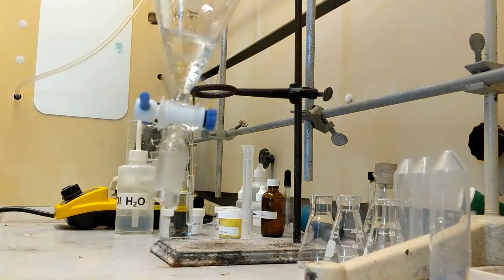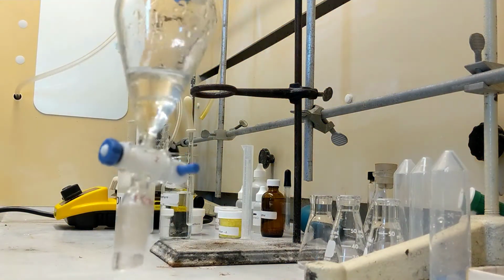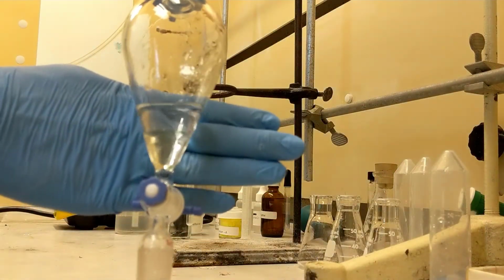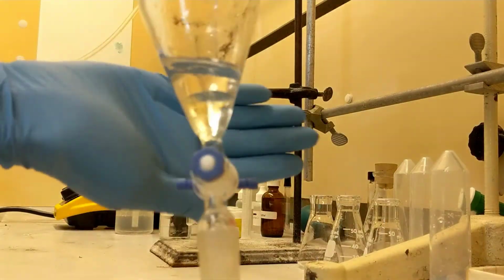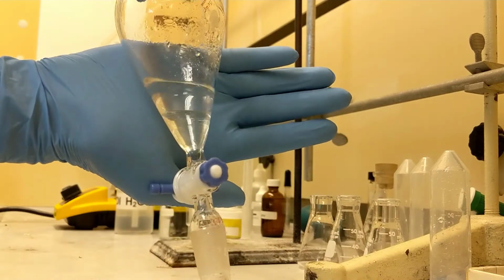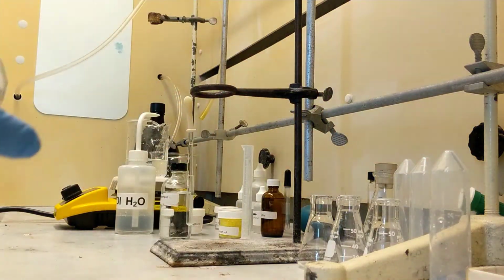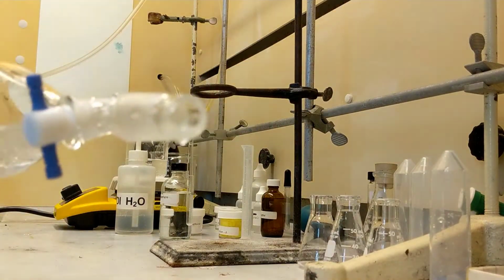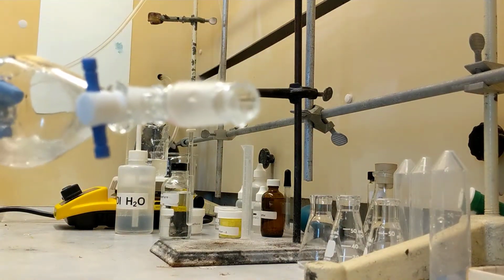Just gonna let it come back down and separate out again. Make sure I don't have an emulsion. As you can see, there are two clear, distinct layers with no third layer in between. So I'm going to shake this a little longer and then I'll bring you guys back.